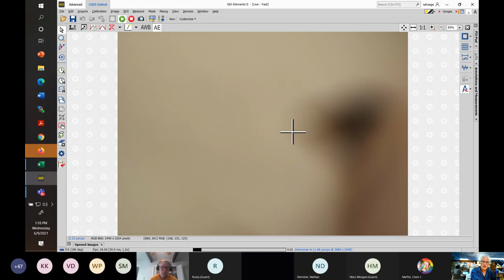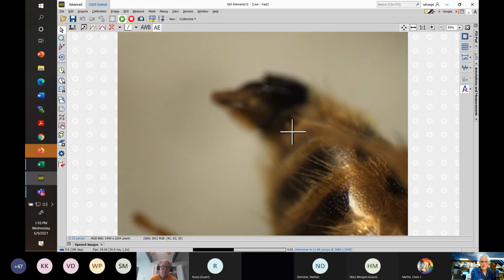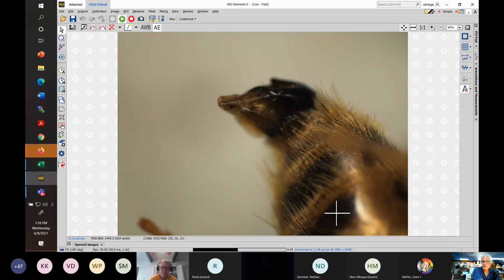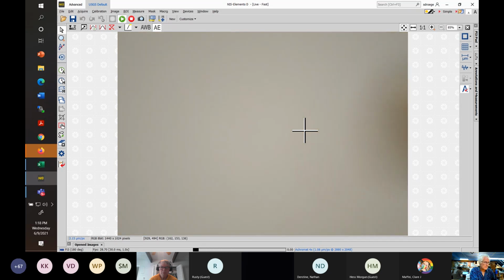And let's see if we can get a shot here on the underside. So that would be the sternites. All the plates you're looking at on the top of the abdomen would be the tergites, and there's a counterpart sternite on the bottom. Now we're looking at the underside, so sternites on the bottom. So here's a sternite. I don't know which one it is. It's probably 4, 5, 6, and I don't know if this is going to be the best one. I'm going to get a second specimen here that may show S8 more clearly.